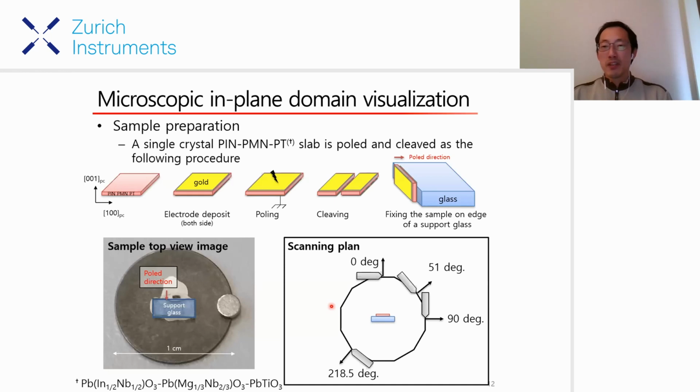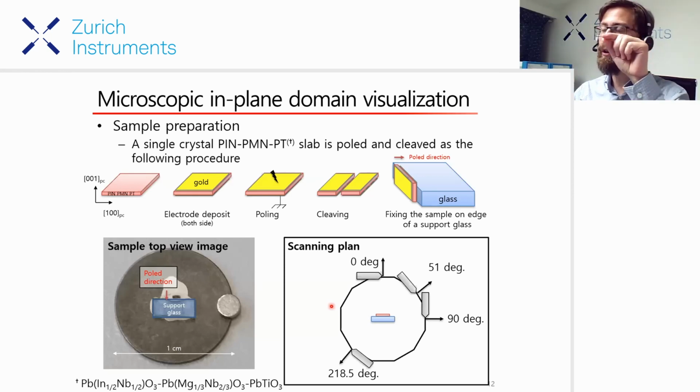Well, it really depends on how quickly you can get to the same position. In this case, it takes about 12 hours in total. Most of the time you can reconstruct, because you can see some feature and find the same feature again.